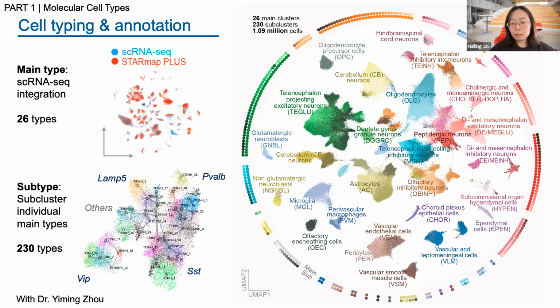I think I should probably have backup slides for this. Okay, so if they are clustered together, it means that those cells actually are the same cell type. So you do the annotation like this, right? In this way.